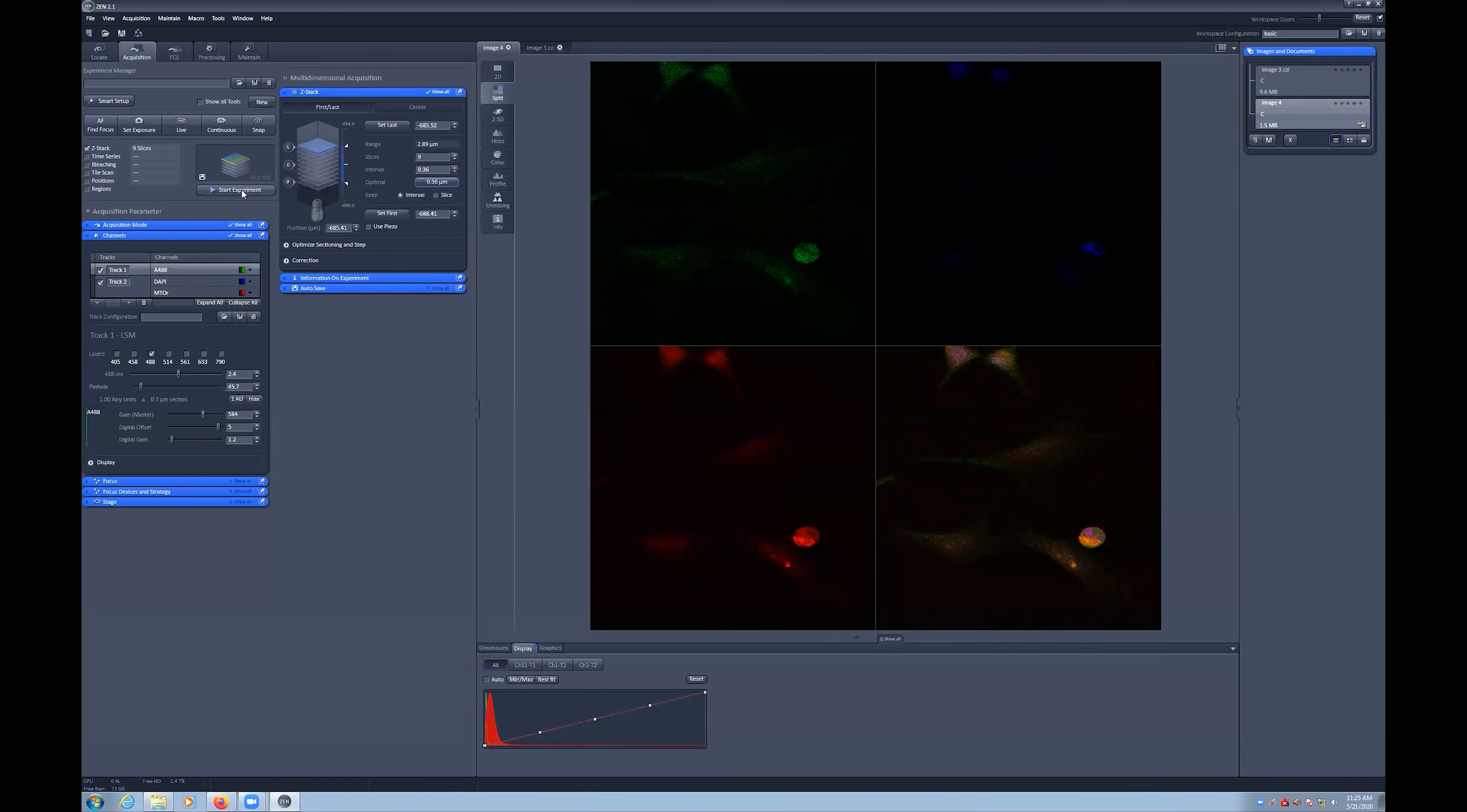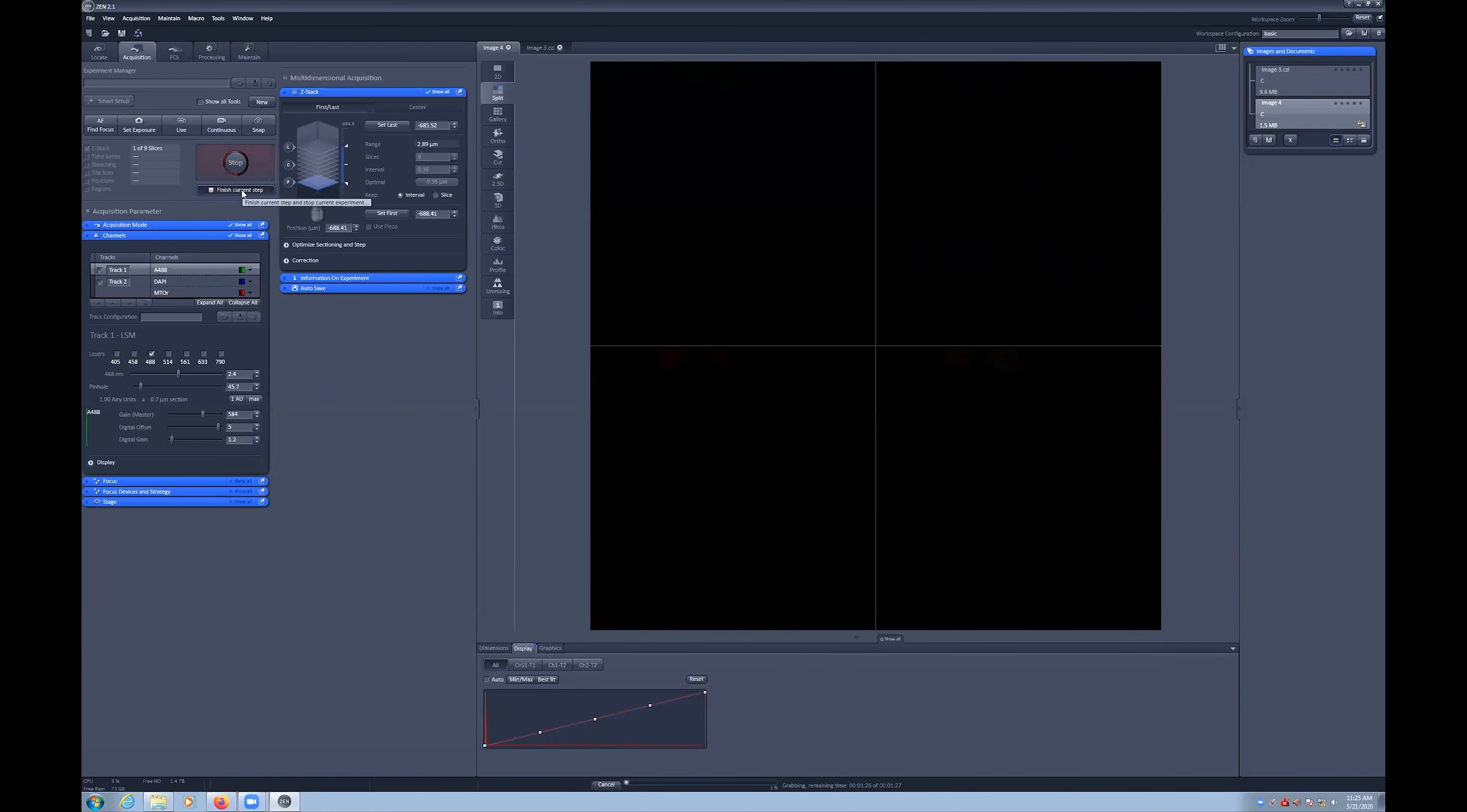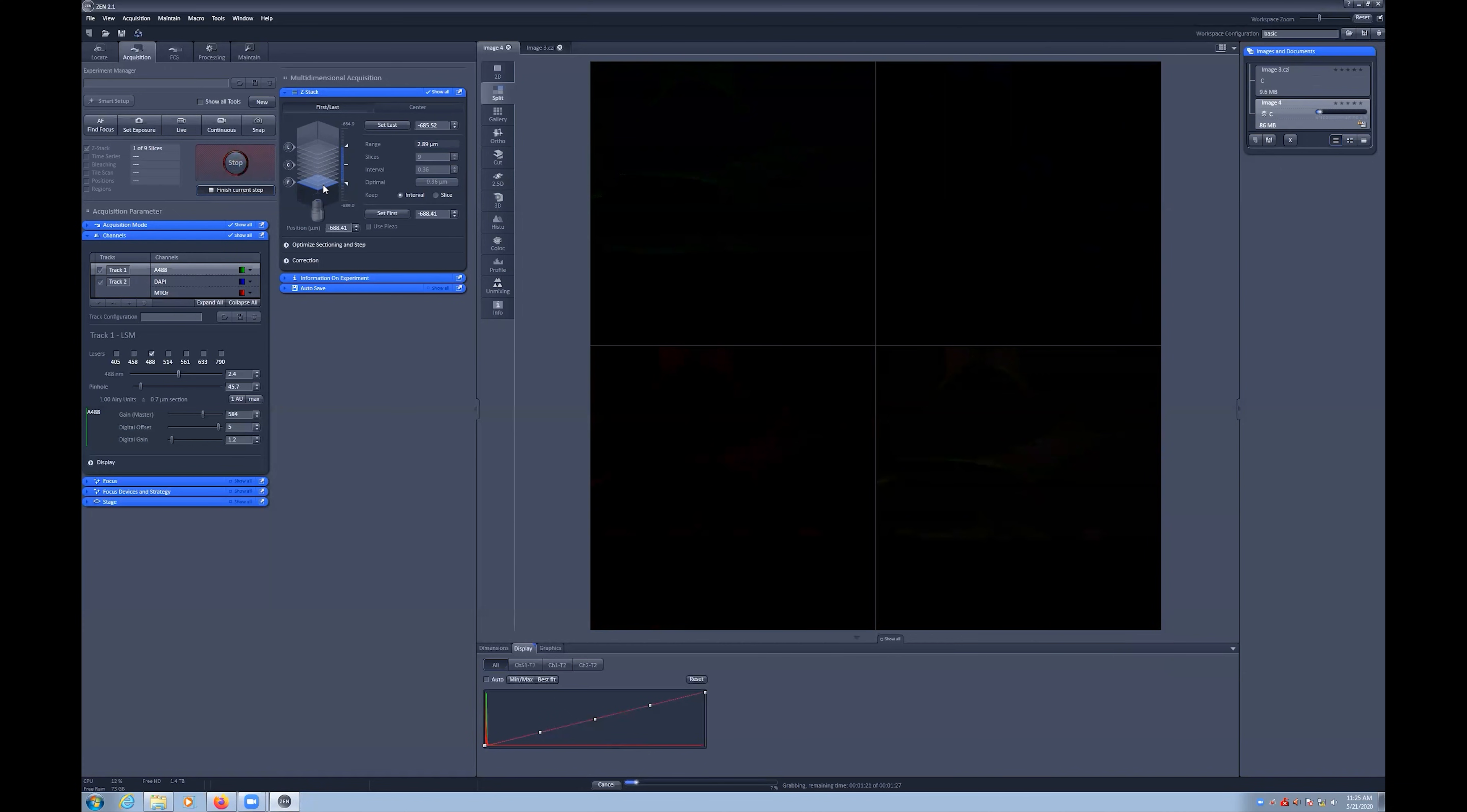To begin the capture, we now select the Start Experiment button, which will begin the acquisition. The 3D model will show you the slice that you are currently imaging.